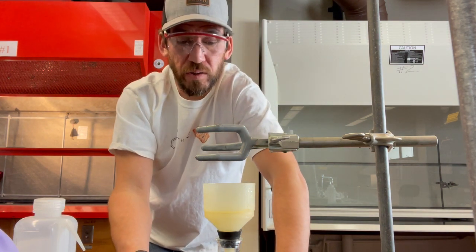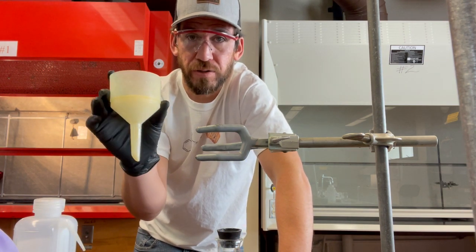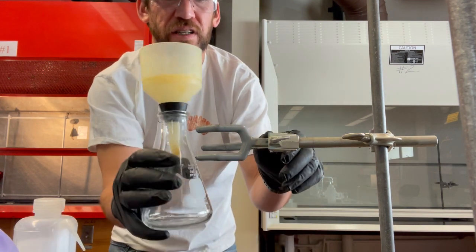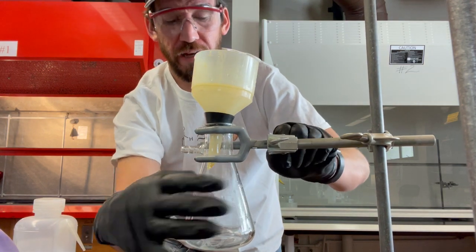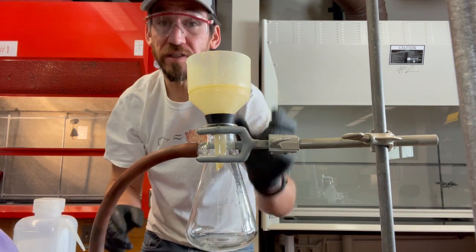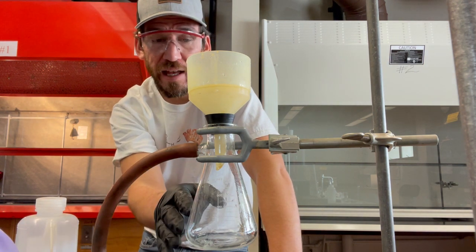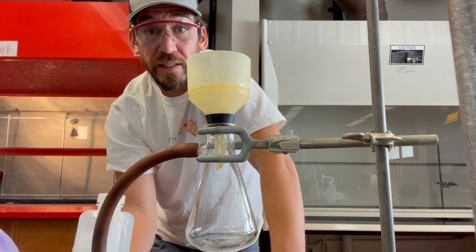So really what I want to do is get as big of a filter as I can. I got this giant Buchner funnel, but even though I washed it with soap, you can see that it's kind of gross. It's almost like we were doing Ochem with it. So I'm going to place that on a vacuum filter. I did wash with soap. Soap doesn't always do the trick with Ochem, organic chemicals. I'm using a different flask because I'm just going to toss this in the proper waste container when I'm done. But I'm going to hit it with some acetone and see if we can get that cleaner.